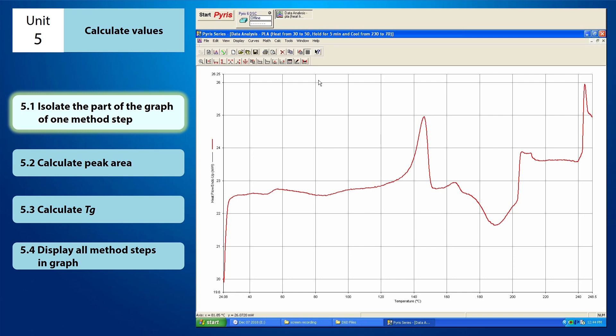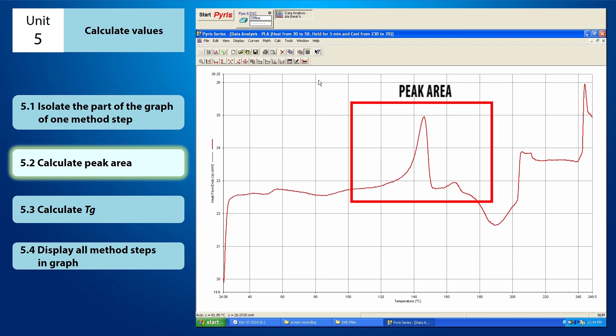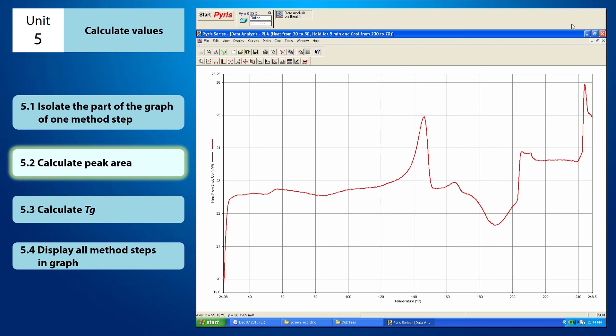Now we can calculate the value of the peak area if you have one that needs to be calculated. This is how the peak area looks like — it has a shape like a bell. Now you can begin to calculate the peak area.